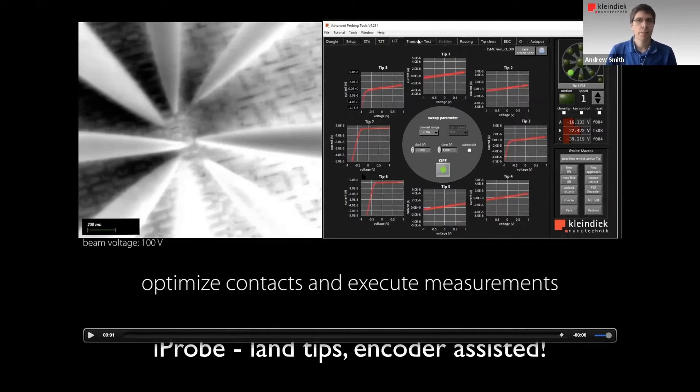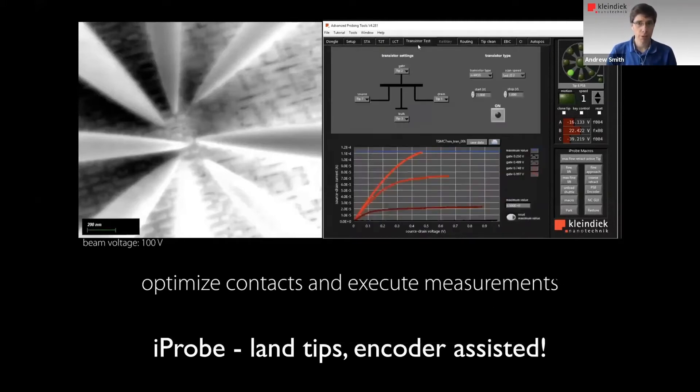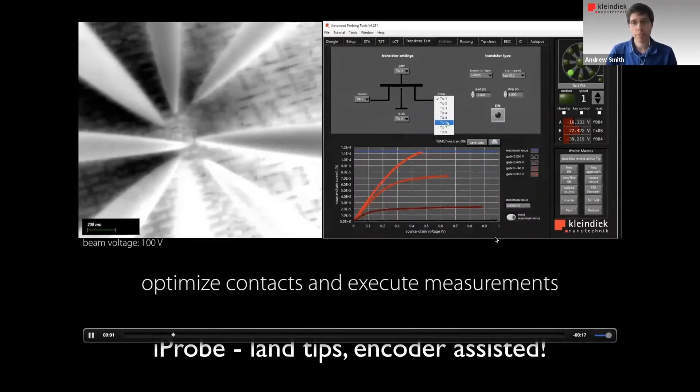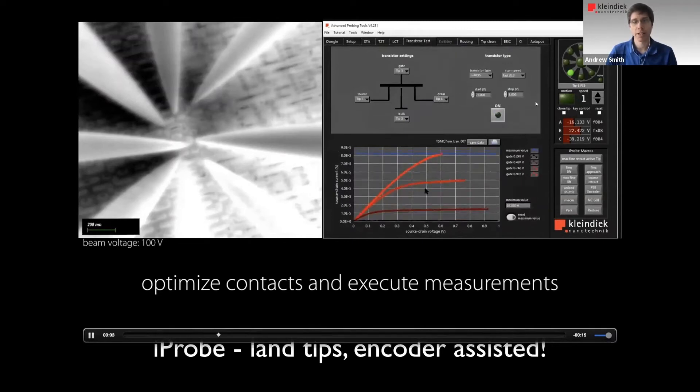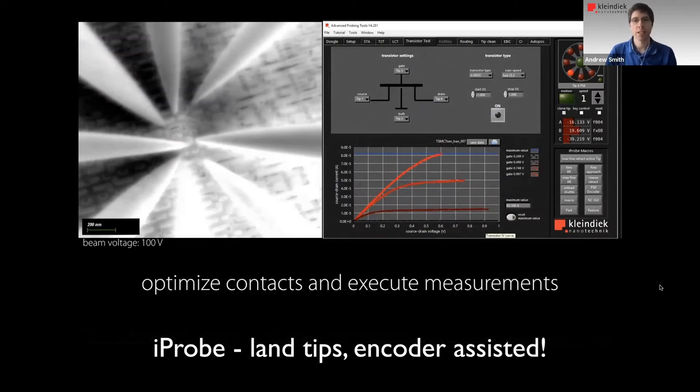And typically, the gate contacts are not connected to bulk. So in order to ensure that the gate contact is also well-placed, we perform a similar measurement where we run just ID families. So we do 10 families per second and ensure that these families look clean and nice. So if we were to raise one of the probes, then this would all go to noise. And if you land it down again, the curves come back into view. So that's how we ensure that the tips are in place and that we have good contact.